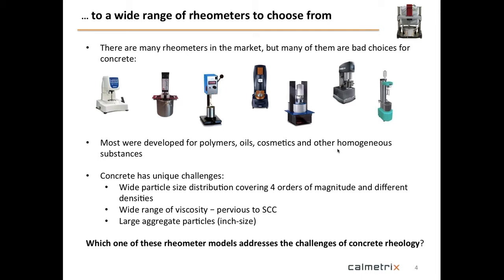And although the concrete industry is one of the largest in the world, you will find that most instruments that you buy were actually not meant for this industry, or they were not designed specifically for it. They were adapted sometimes, and sometimes not even adapted for it. So the cement and concrete industry is very often the stepchild of lab instrumentation. And even things like the Hobart mixer that many, if not all, people have in their labs was originally not developed for cement and concrete. It was really developed for bread, as we know. And it has hardly been adapted very much to work for concrete mixtures or mortar mixtures.